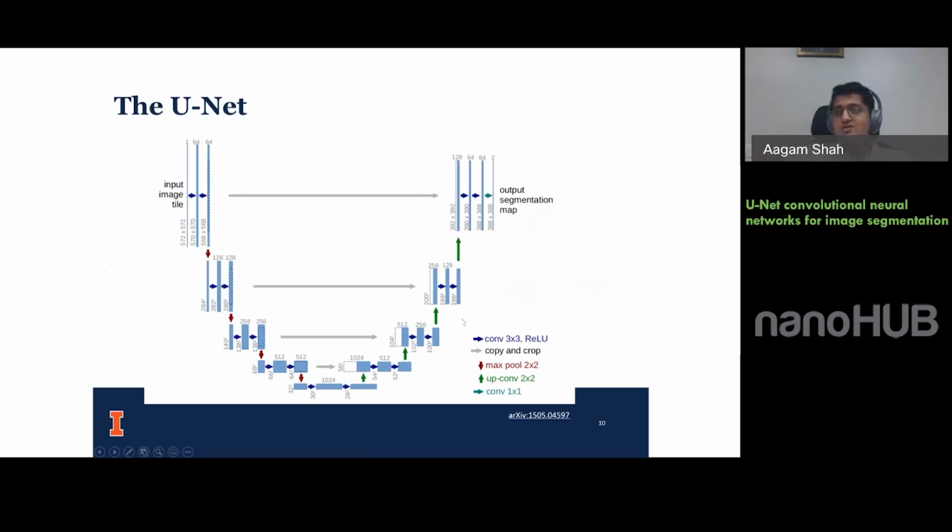The key takeaway here, and you will see this once we go to the Jupyter notebook, is that Python libraries have made it such that we don't really need to understand these complex functions to be able to implement them. We can just use somebody else's work essentially and make really good neural networks.